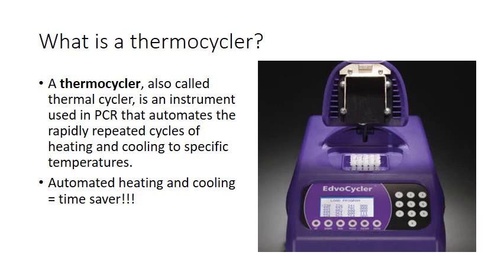All right, but the cool thing about it is not that it just changes the temperature really quickly, but that this piece of equipment just knows when you need to switch it out. It's already pre-programmed. You just have to put it in there and hit start. It's just like the most amazing invention ever. Unless you had to really go back and do that individual hot water bath step over and over again, you really don't quite appreciate the laborious task of switching those test tubes. So this is a tremendous time saver, and you don't have to worry about messing it up. It does it all for you.